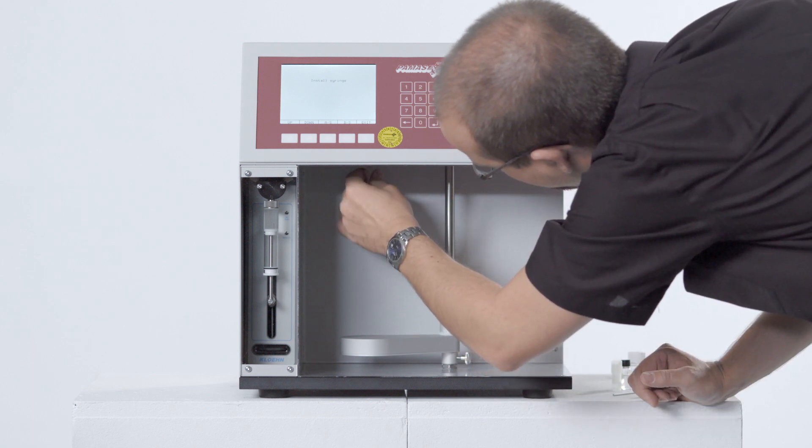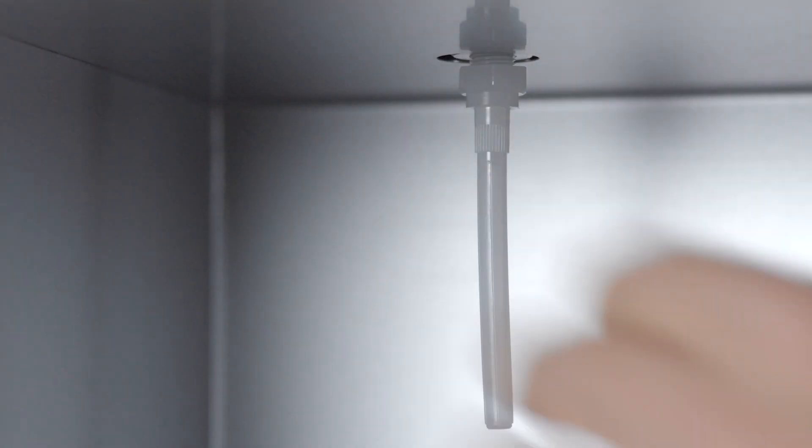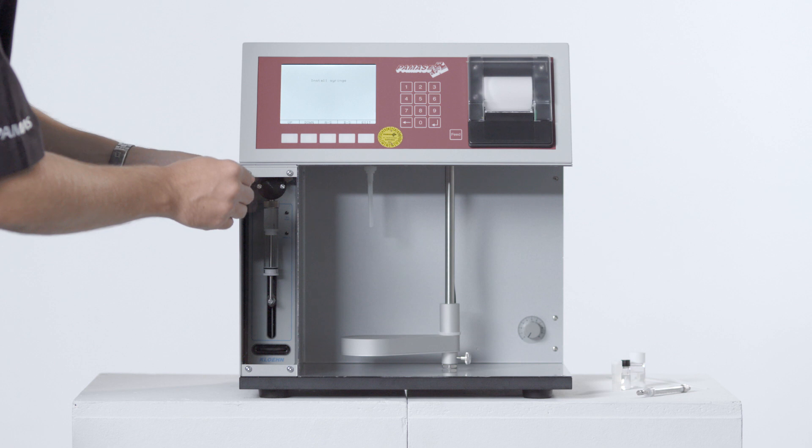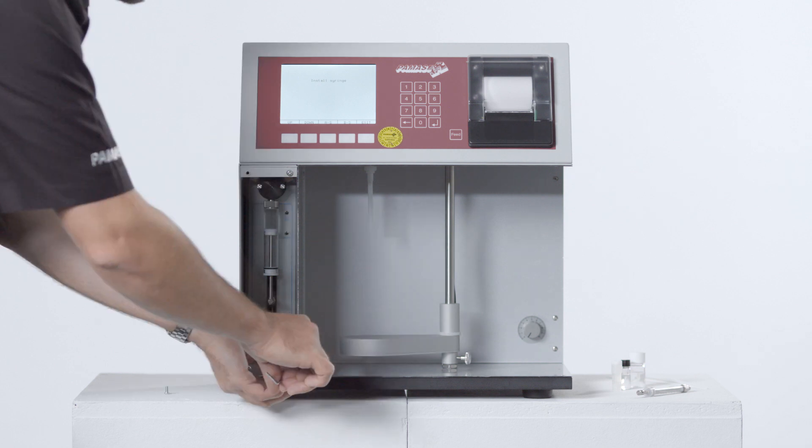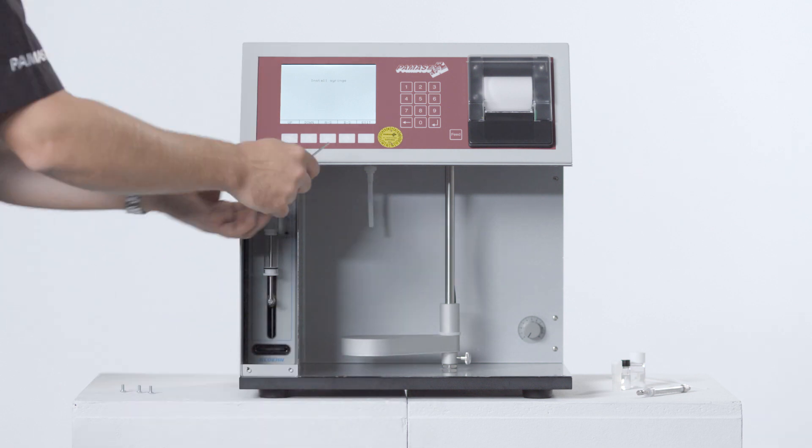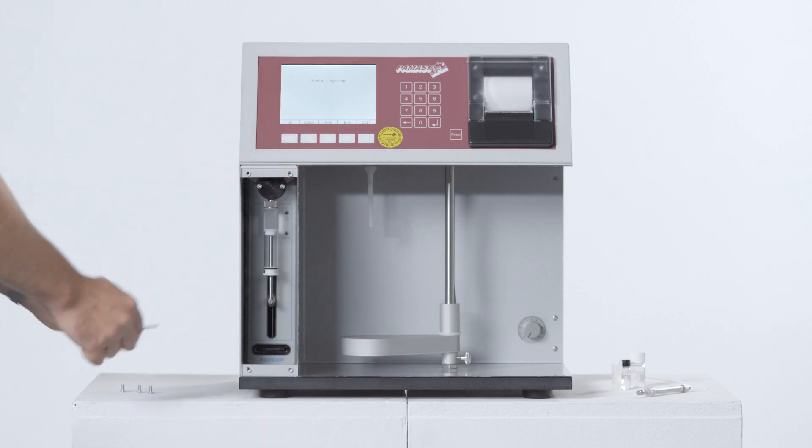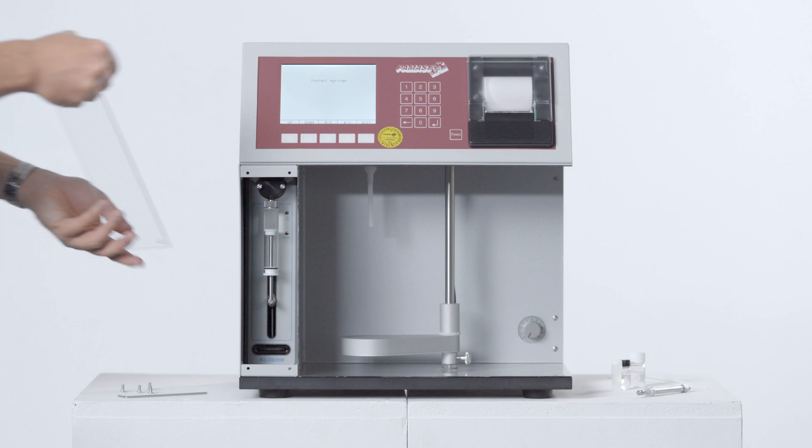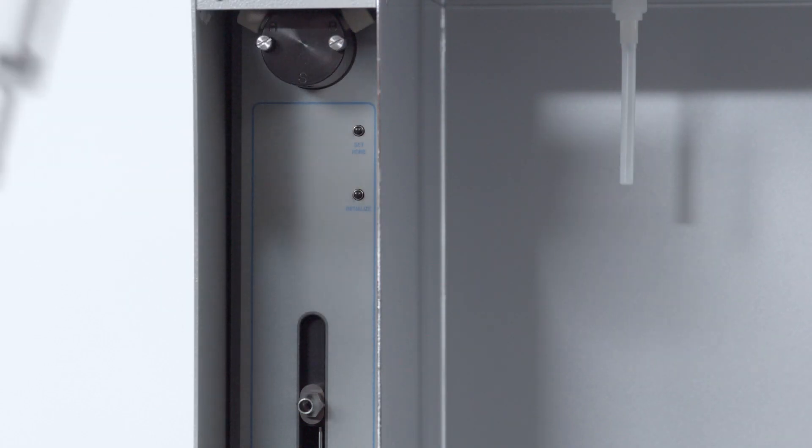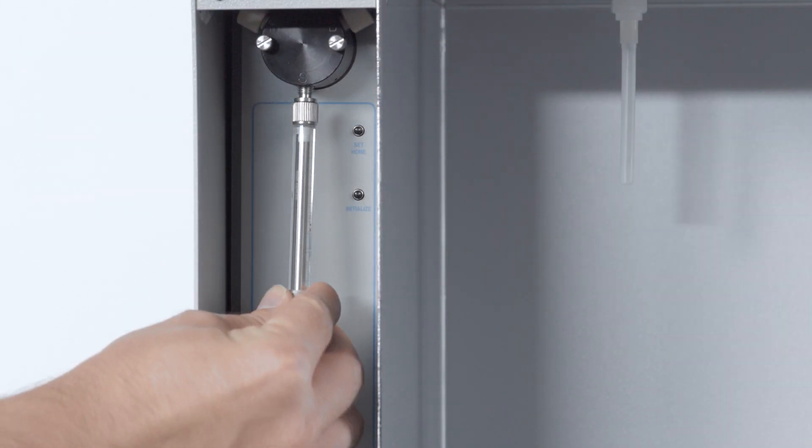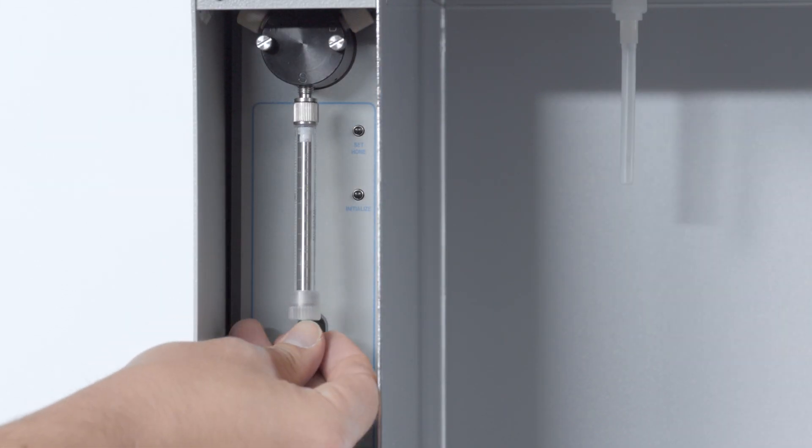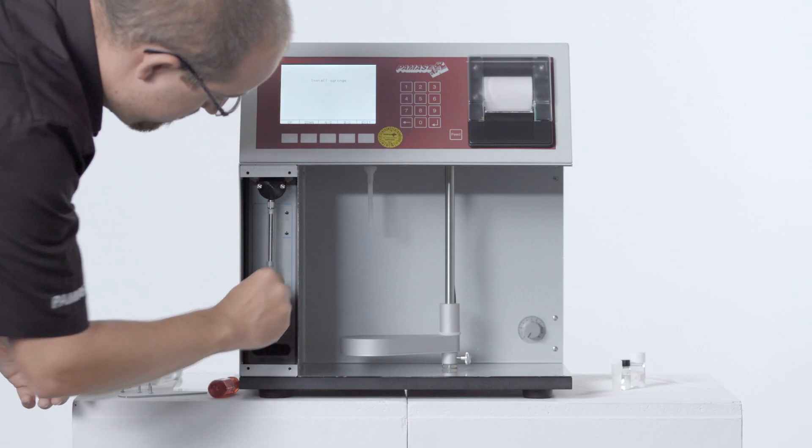Smallest sample volumes down to 100 microliters are analyzed with another sample adapter. For utmost accuracy, the syringe for flow rate control is exchanged as well, so it ideally fits to the smaller sample volume.